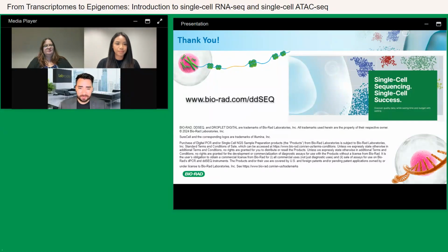Perfect. Thank you. Our next question is, how does the deconvolution process differ between single-cell RNA-seq and single-cell ATAC-seq? Yeah, I'll go ahead and talk about that one. The deconvolution process is slightly different for the single-cell ATAC kit and the 3' RNA-seq kit.